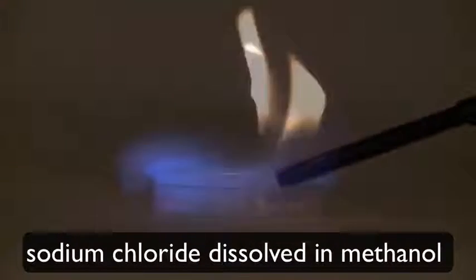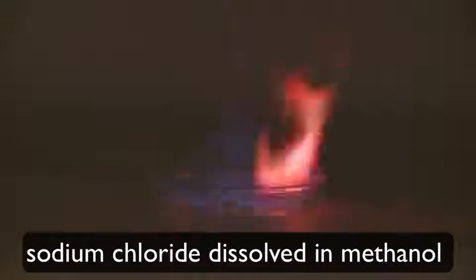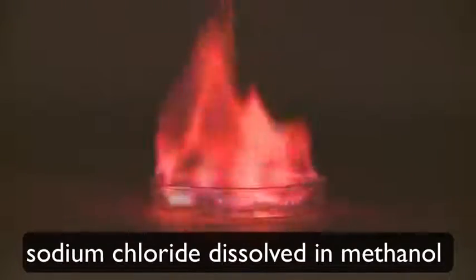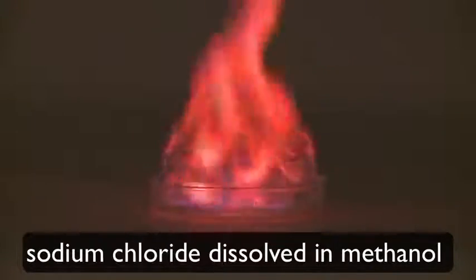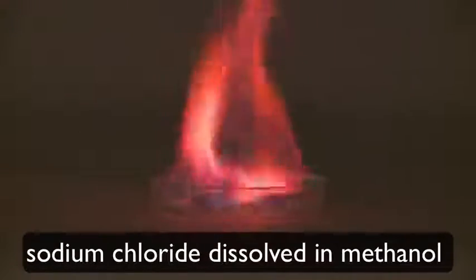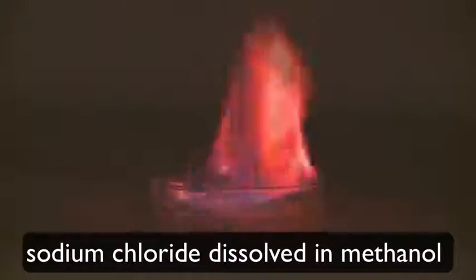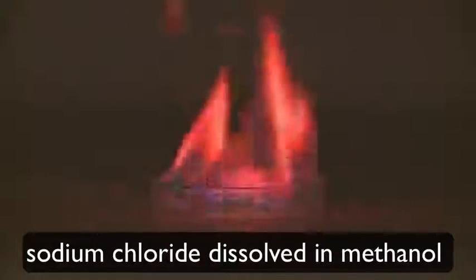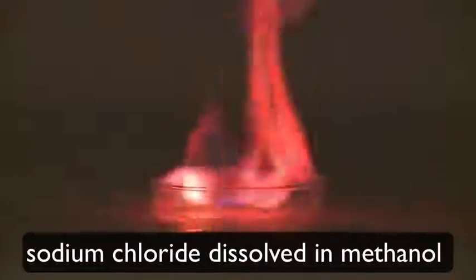Next, he has a solution of sodium chloride dissolved in the methanol. If you are driving down the highway at night and you see yellow lamps, those are sodium vapor lamps. The color of flame also depends on temperature, so we might not see the color right away for some of the samples. Each flame needs time to get extremely hot to yield the maximum emission from the metal. On the camera, this sodium burning looks kind of pink, but in real life it was quite yellow.